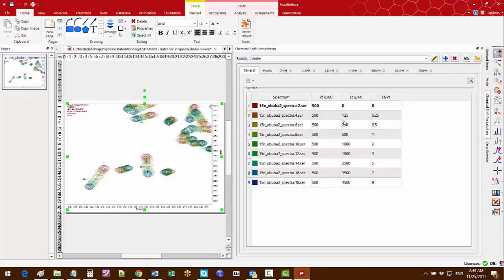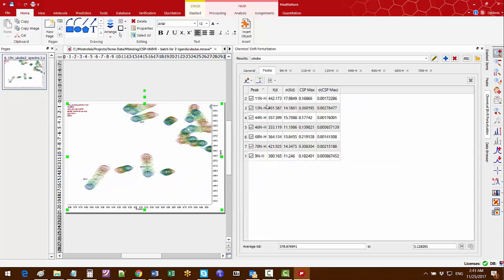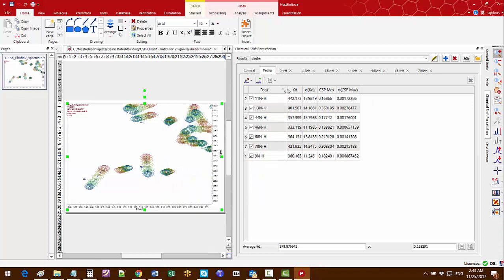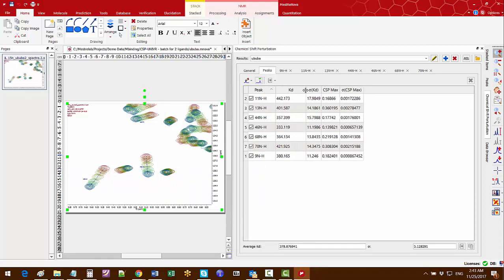From the general tab you can see the spectral names, protein concentrations and ligand concentrations for the current titration series. In the peaks tab there is an overview of all the peaks, their KDs and chemical shift perturbation values.